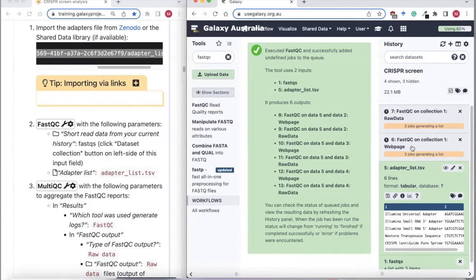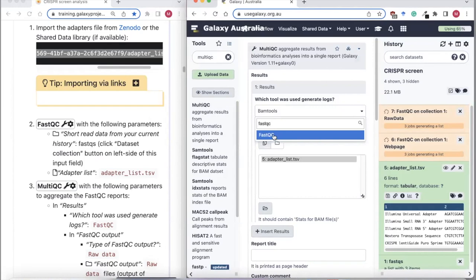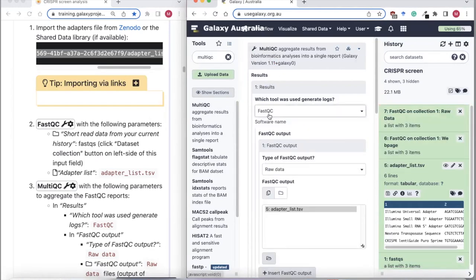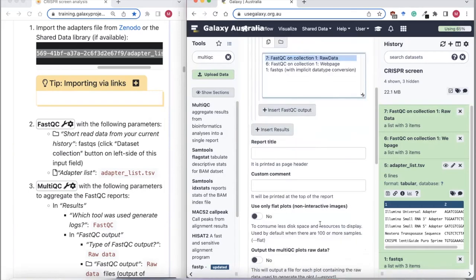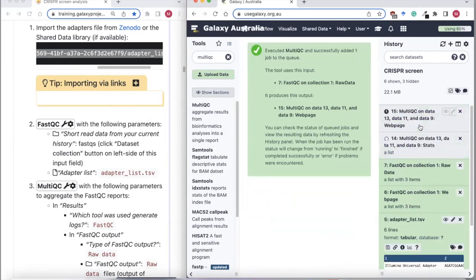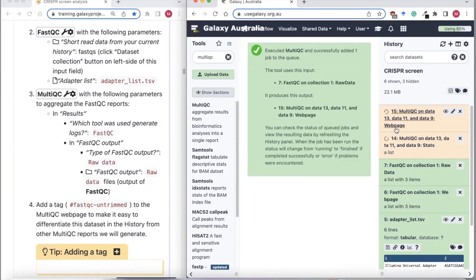FastQC will output a report for each of our three samples. We can use a tool called MultiQC to aggregate these multiple reports into a single one, to make it easier to view results when you have many samples. We tell MultiQC what tool we used to generate the reports — in this case FastQC — and that the raw data is in a collection. Click Execute.